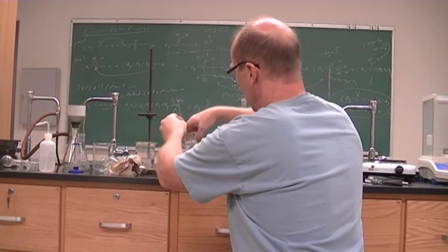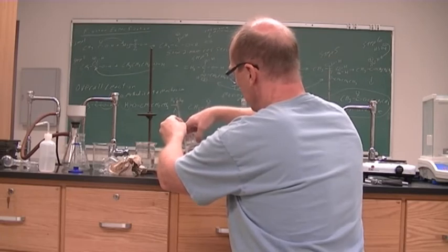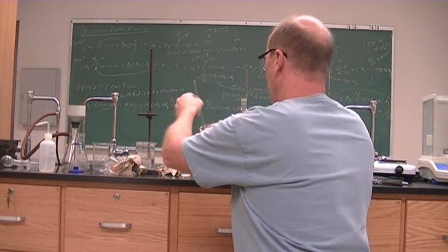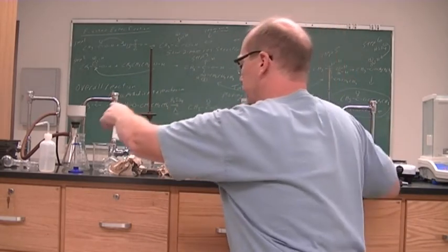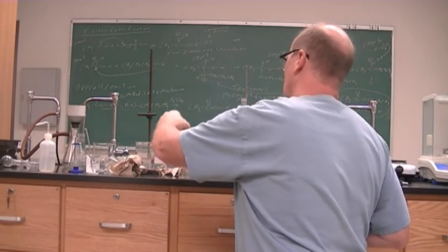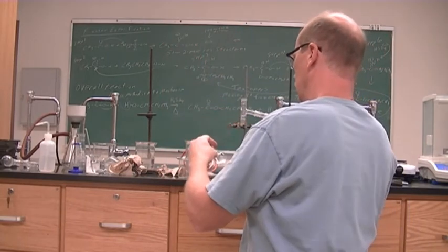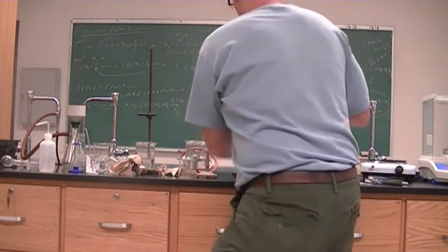Alright, we're going to see how this distillation goes with this magnesium sulfate. Something I've not tried before. Decanting always seems to work a little better than this. Alright. Let's see how that goes. That is a lot of solid in there. All right, let's see what happens.